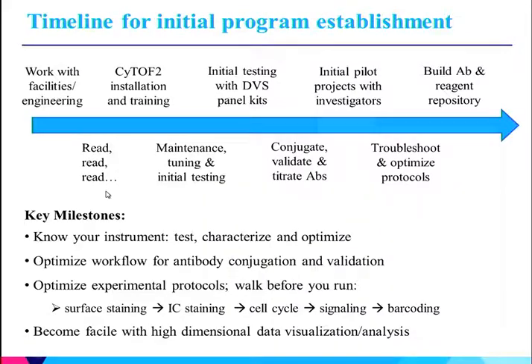So that's the evolution of how things have moved over time. And I just wanted to briefly mention some of the key milestones right at the start that are important if you're thinking of getting a CyTOF and starting a new program. So one of the points I mentioned before is that you actually do need to have pretty strong support from your institutional engineering facilities in setting up an appropriate space for this instrument. And that should really get done before the instrument gets here.